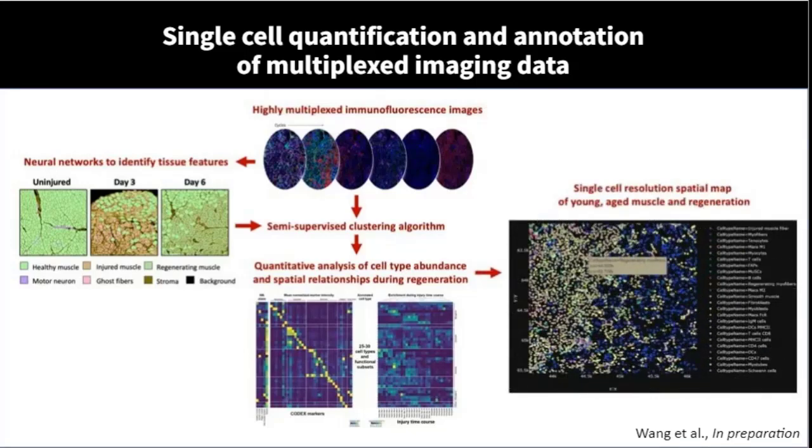And I cannot stress enough how important cell annotations are, and comparing your annotations to what is actually in the image and what pathologists or human experts would actually annotate these cells. Because it's used for downstream analysis for spatial relationships, it's really important to make sure that this step is as accurate as possible.